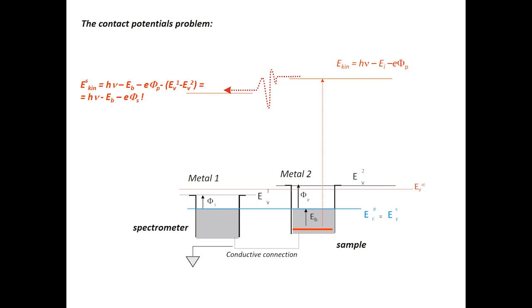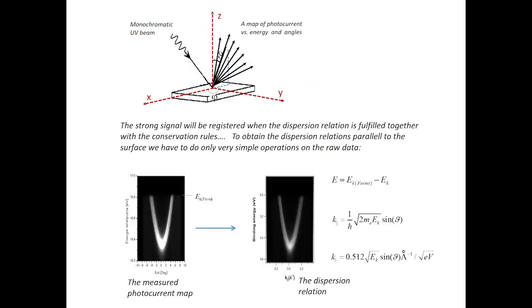It's a little bit technical, but it's a very important point that you can really measure this with devices which are actually metals. So it's good to think about your sample as a metal, or at least having the Fermi energy defined. So you must have conducting electrons, must be conductive. So they change the electrochemical potential, and okay, let me skip this.